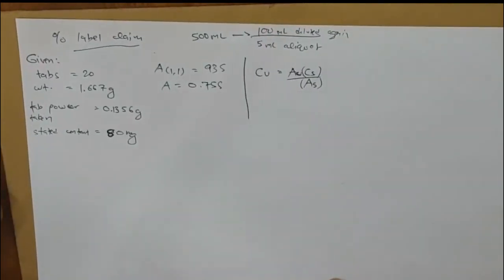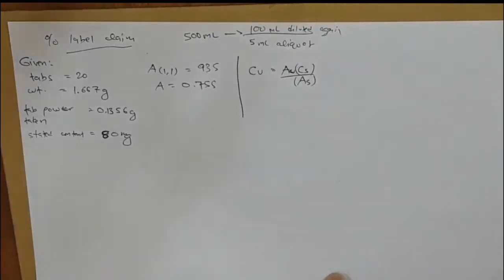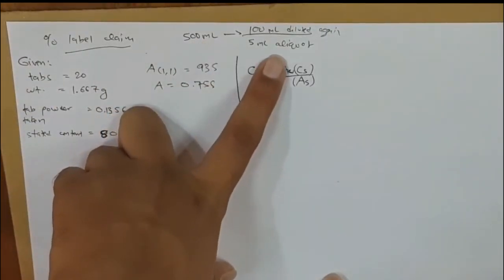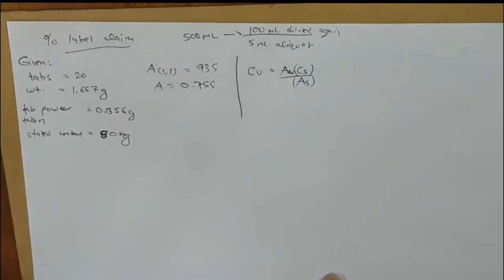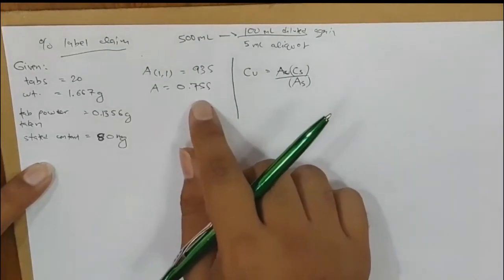The paste is then diluted with 200 ml of water, shaken for 15 minutes, and finally made up to 500 ml. A portion of the extract is filtered and 5 ml is taken for dilution to 100 ml with 0.1 molar hydrochloric acid. Absorbance is read at wavelength 251 nanometers.